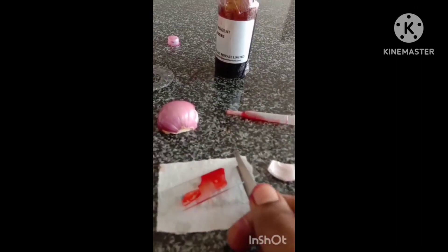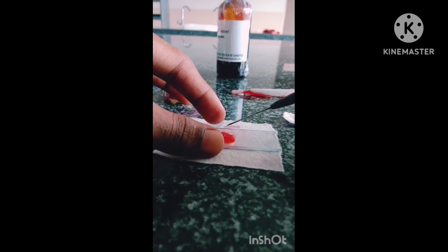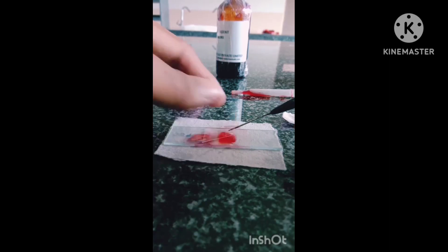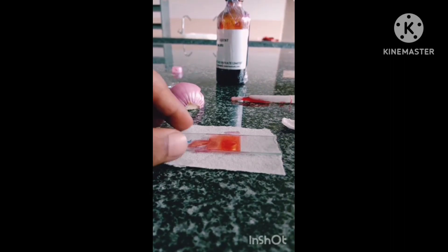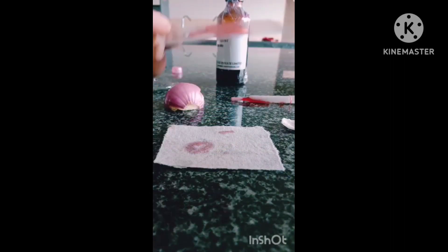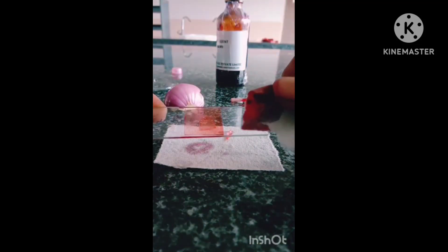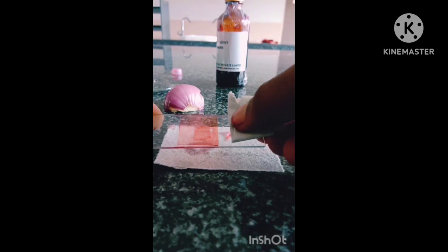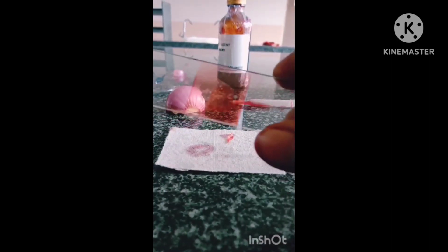Now put a coverslip with the help of a needle and avoid air bubbles. Gently place the coverslip, then remove the excess stain with the help of blotting paper. Clean the slide with blotting paper and now you can watch it under the microscope.